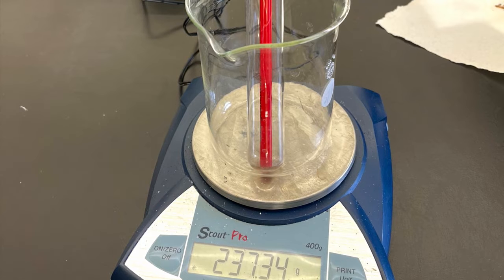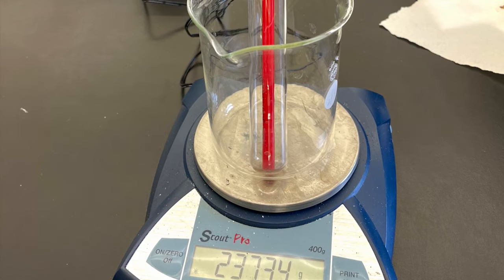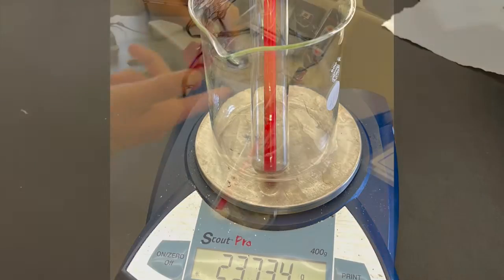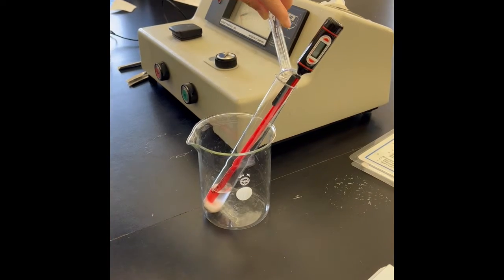First, assemble the apparatus consisting of a large test tube, the digital thermometer, and a beaker large enough to hold the test tube. Weigh the apparatus on the top loading balance to the 1/100th place. Add the appropriate amount of the unknown salt to the apparatus and then weigh the apparatus again. Use the table in your lab notebook to know how much salt to add.